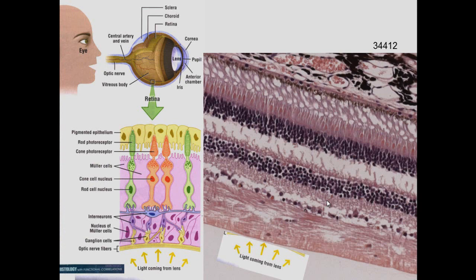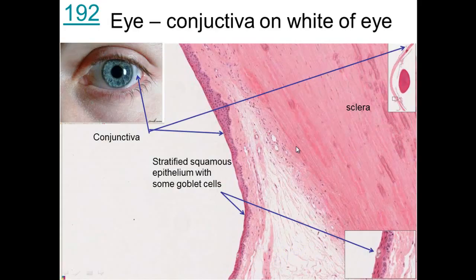Now the main part of the eye, of course, is the retina for photoreception. And here we see the rods and cones, pigmented epithelium, bipolar cells, and the ganglion cells, the different layers that make it. And so the light comes in through here and projects up through there, and finally it hits the photosensitive portion of photoreceptor cells, which are here. Here are our nuclei, here's some of their cytoplasm, but the photoreceptor portion of them is right down in there. And then you have the pigmented epithelium. Below that you have the choroid, the rich vascular supply. So we'll learn all those words.